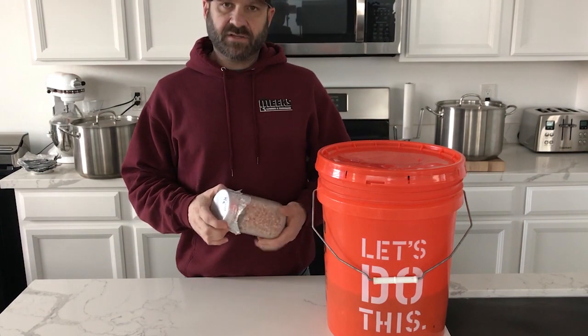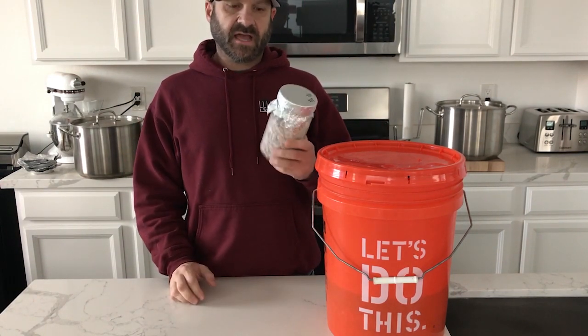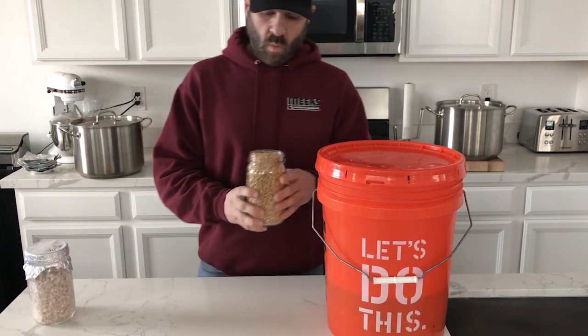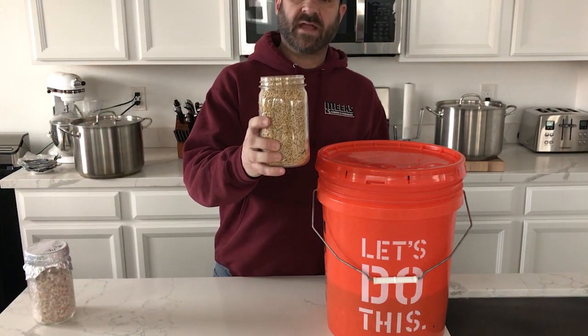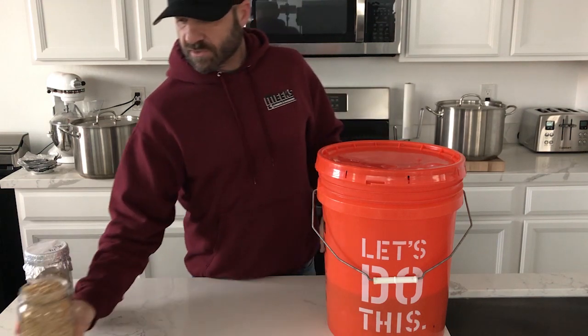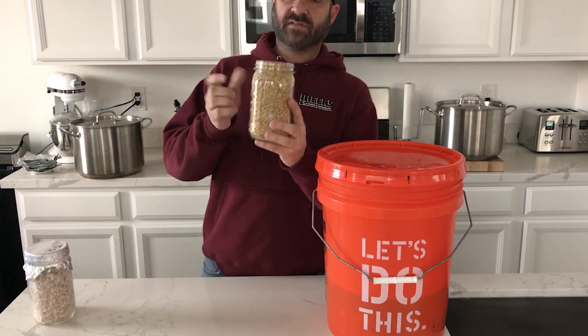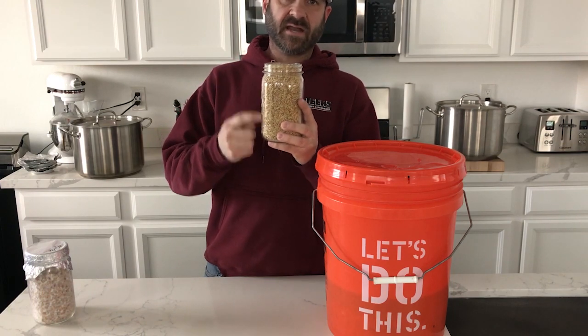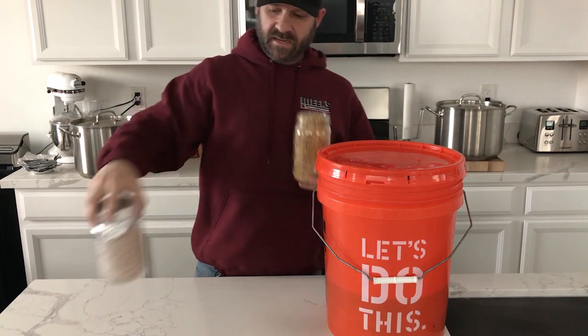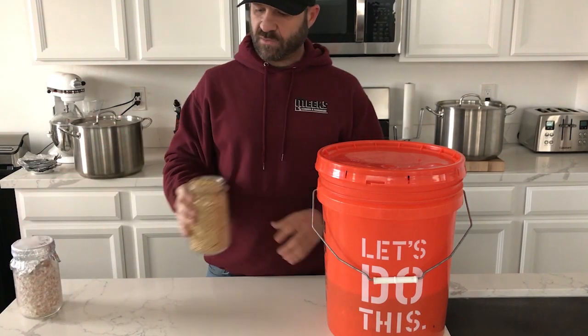I'm going to show you guys the technique I've been using to get seven-day colonization out of my grain jars. Typically when I do dry grain, I'll do a quart jar filled all the way to the top - four of these quart jars filled with dry grain - and then I'll usually fill up 12 jars when it's all been hydrated.